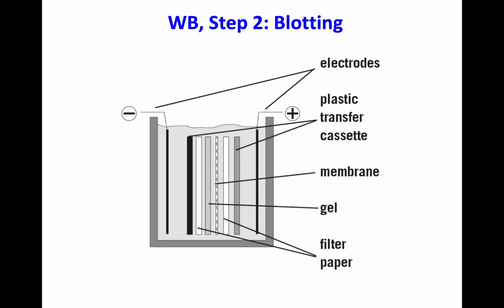So we will have a look at the second step, which is blotting. If you remember your blotting from GE time, I hope you still remember. If not, hopefully it could jog some of your memory. Blotting for Western blot is done horizontally or vertically. As you can see here, it is done vertically as well.